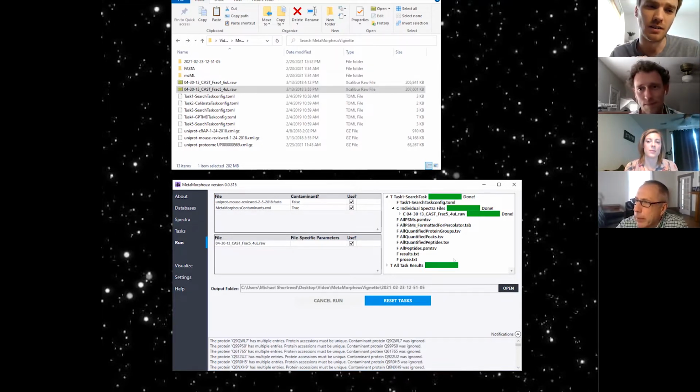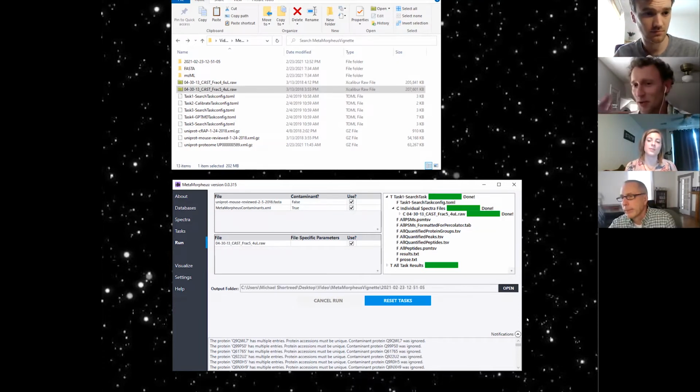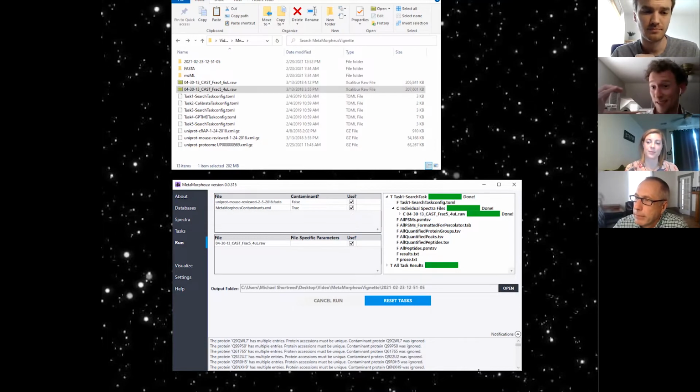If you're running an Orbitrap, high resolution MS2 bottom-up trypsin sample, you really don't need to mess with any settings at all. The defaults are built for that scenario. And for someone who has no idea what those words mean, if you download data from PRIDE, those words should be there: trypsin, Orbitrap or high res.